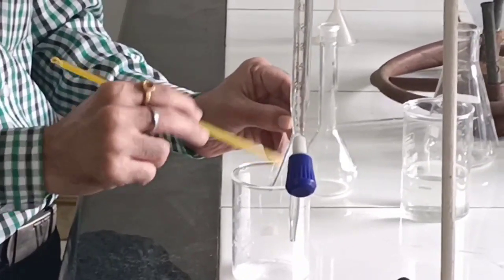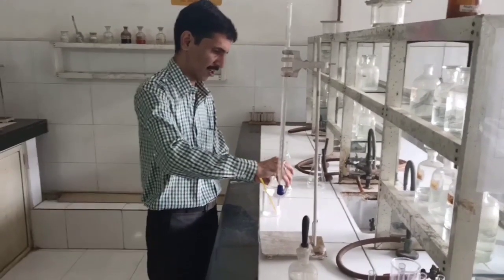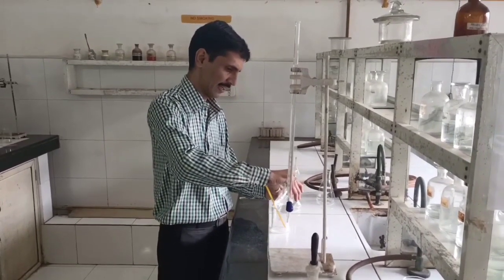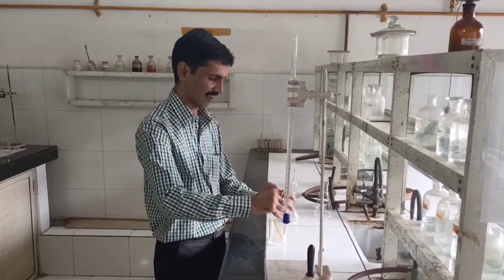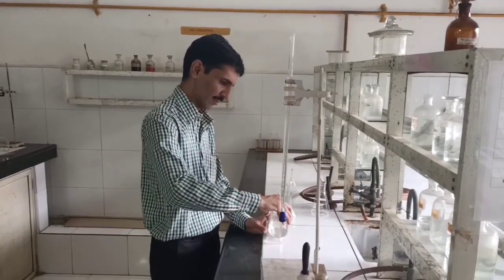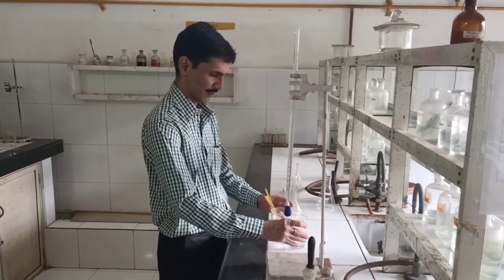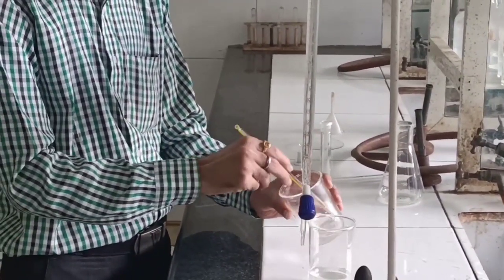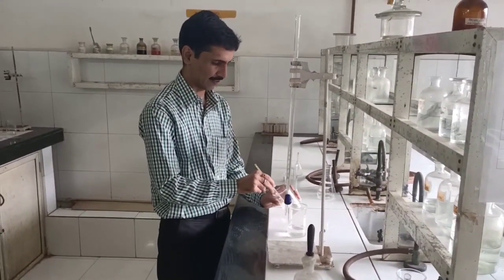into the beaker. Take some small quantity of water and make sure that each and every particle of succinic acid is transferred into the beaker. You can see now, this watch glass is absolutely clear. You can check it out. Now we'll add approximately 40 to 50 ml of water and dissolve it. Succinic acid is a water soluble acid, so it will get dissolved very easily.